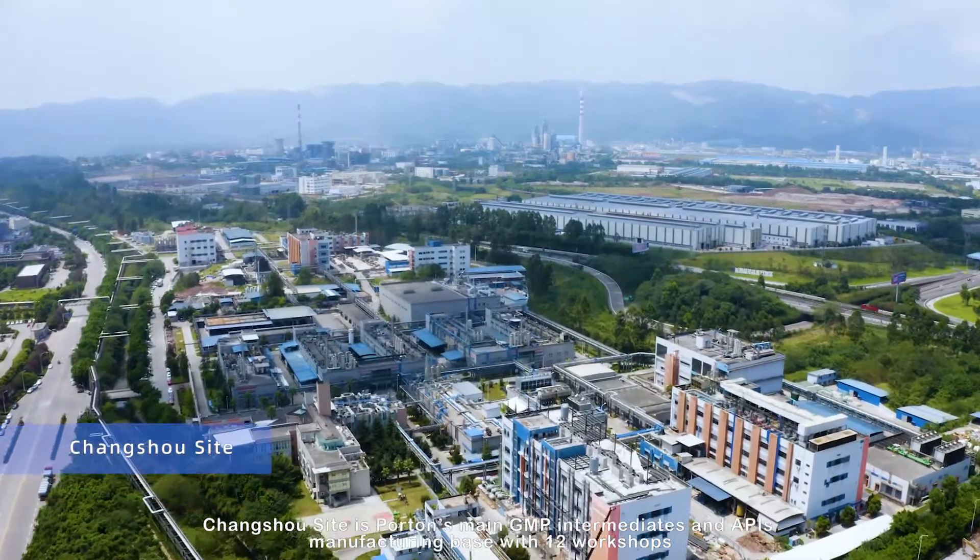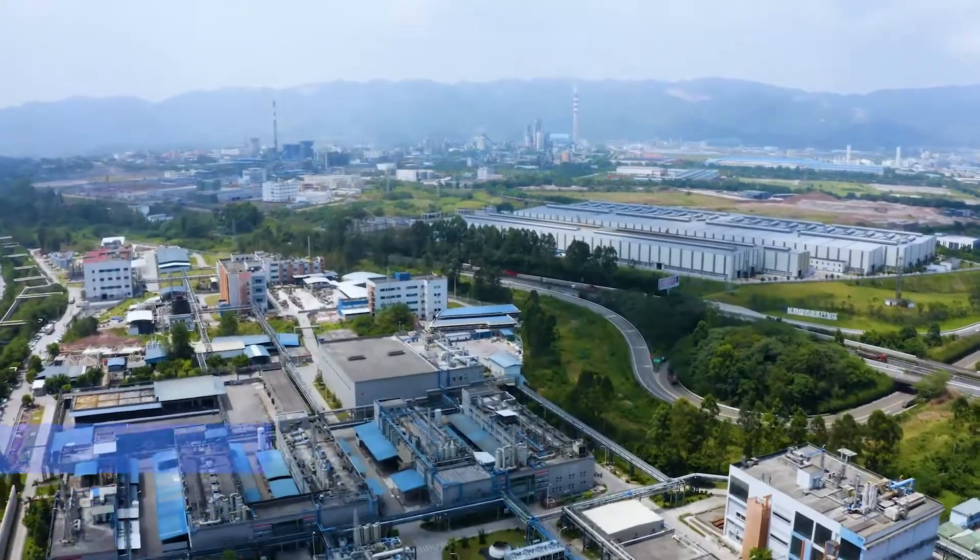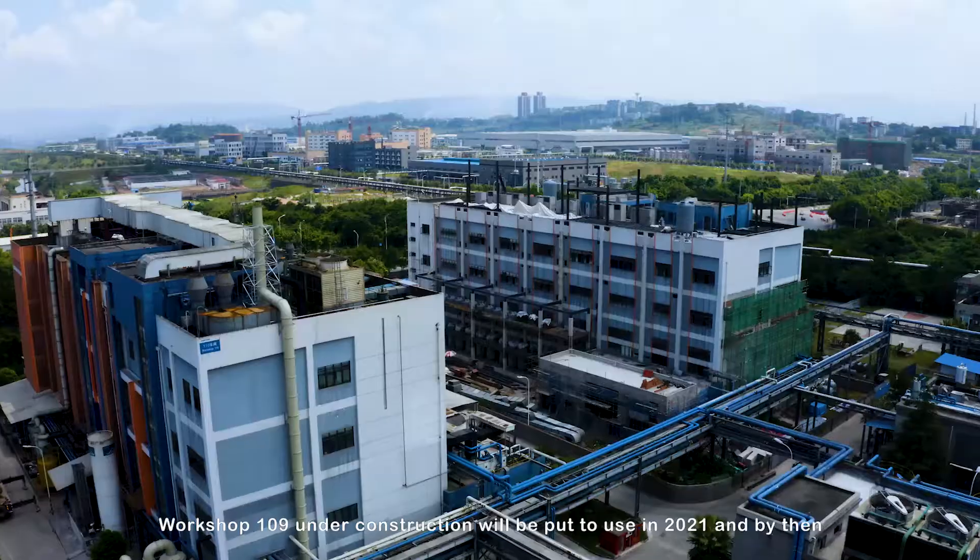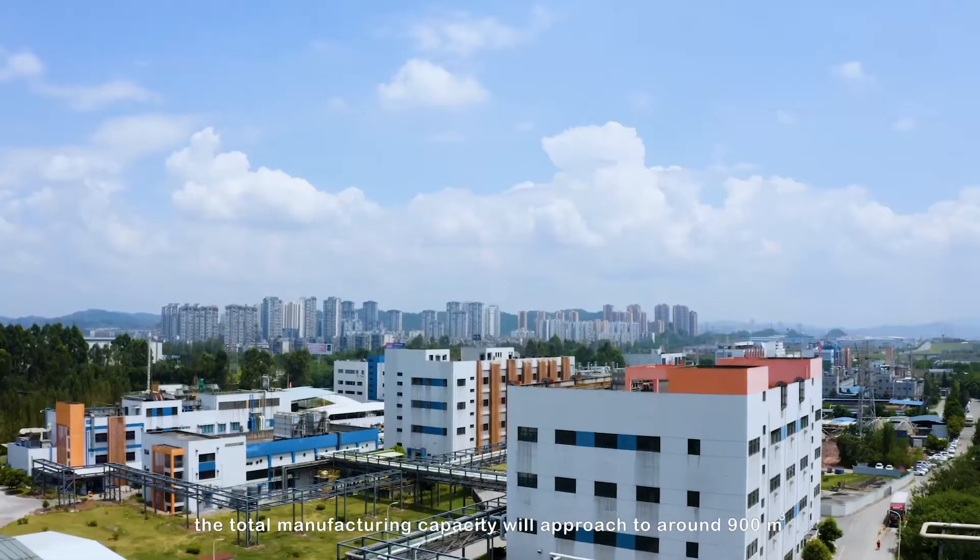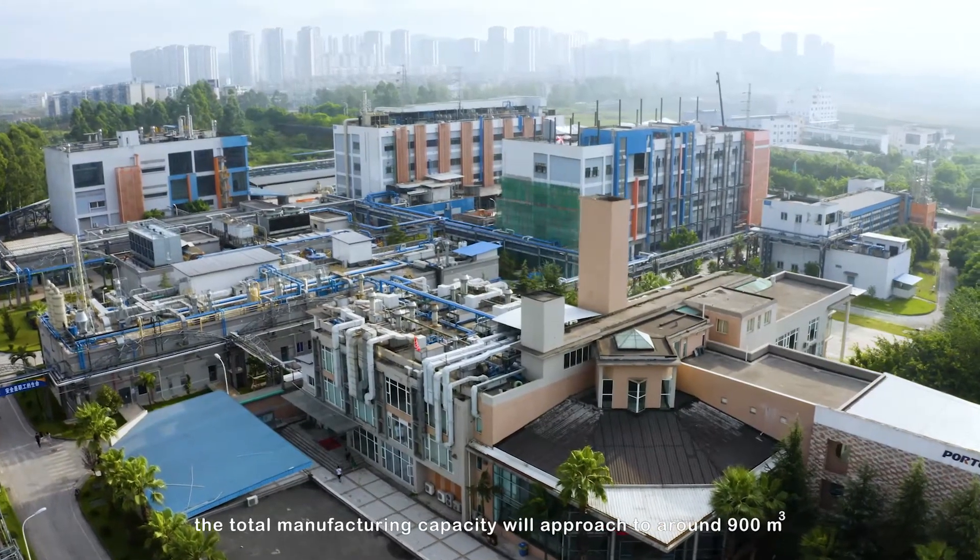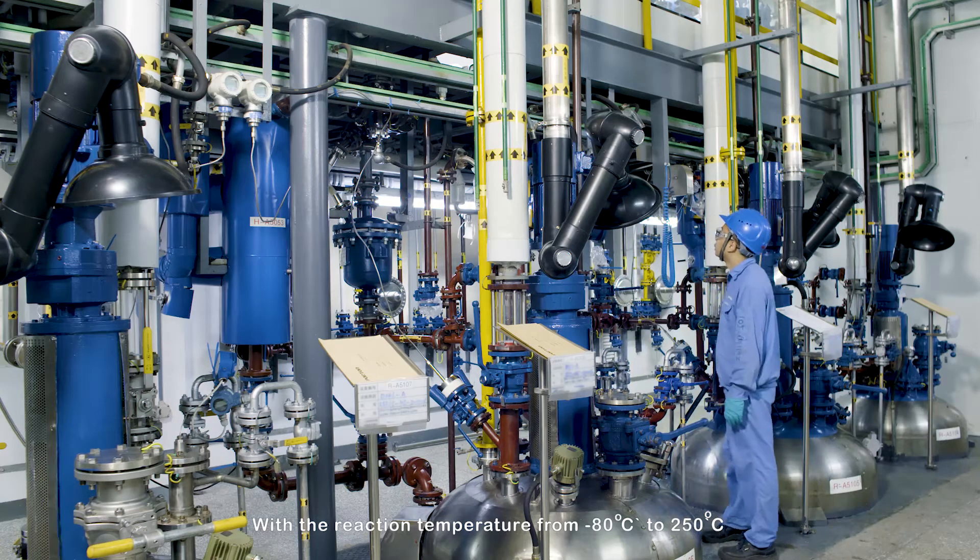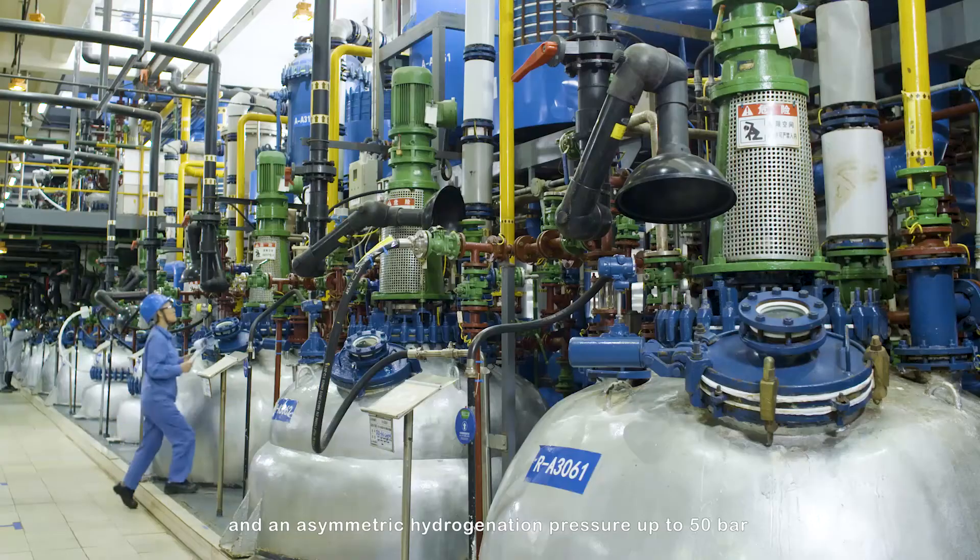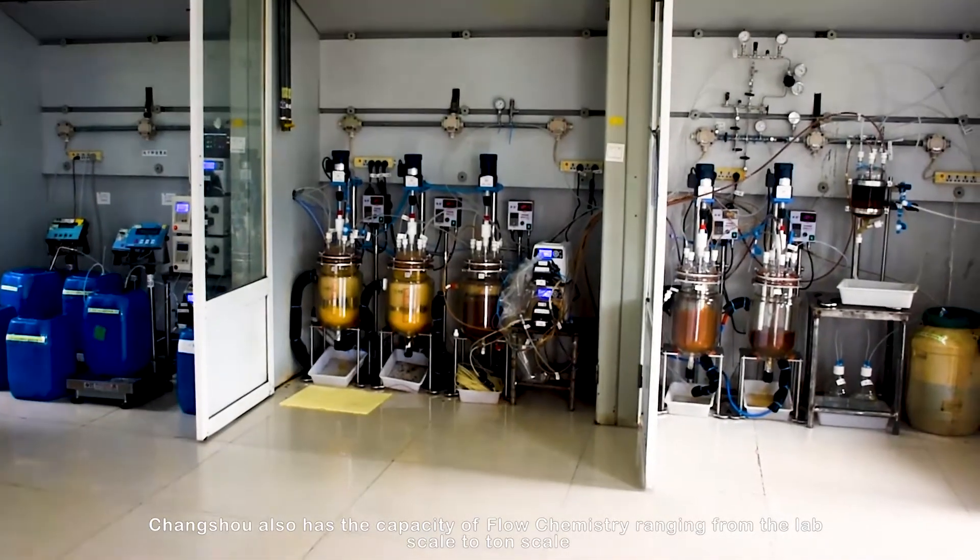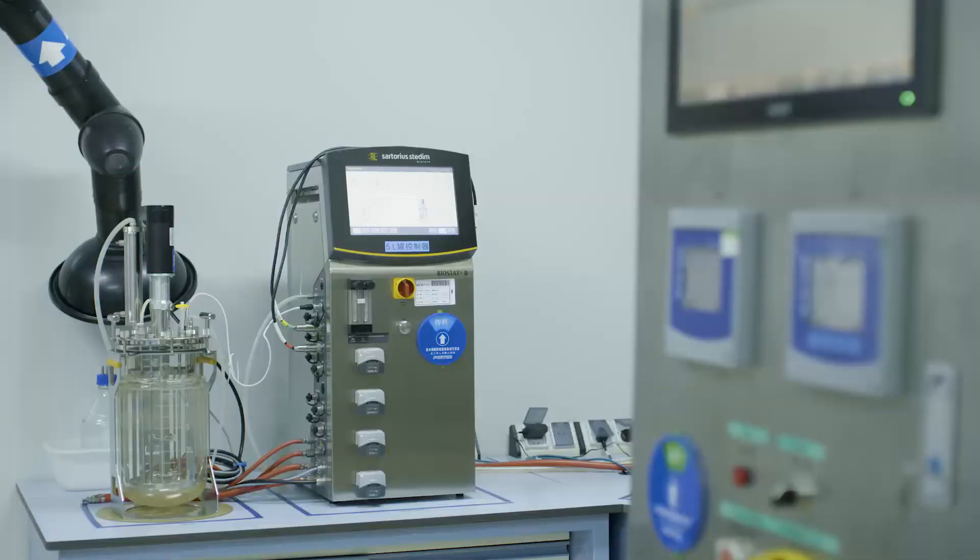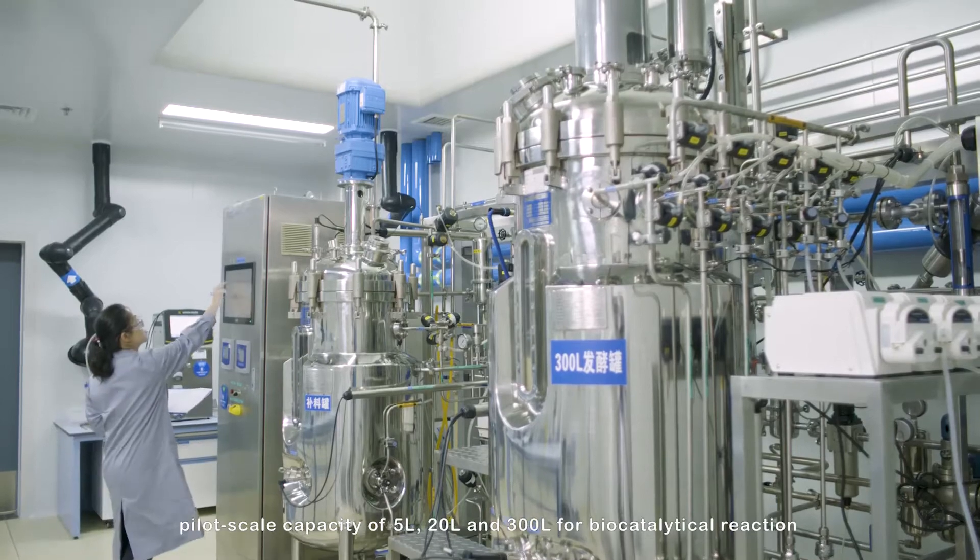Changshou site is Porton's main GMP intermediates and APIs manufacturing base with 12 workshops. Workshop 109 under construction will be put to use in 2021, and by then, the total manufacturing capacity will approach to around 900 cubic meters. With a reaction temperature from minus 80 to 250 centigrade degree, and an asymmetric hydrogenation pressure up to 50 bar, Changshou also has the capacity of flow chemistry ranging from the lab scale to ton scale, pilot-scale capacity of 5-liter, 20-liter, and 300-liter for biocatalytical reaction.